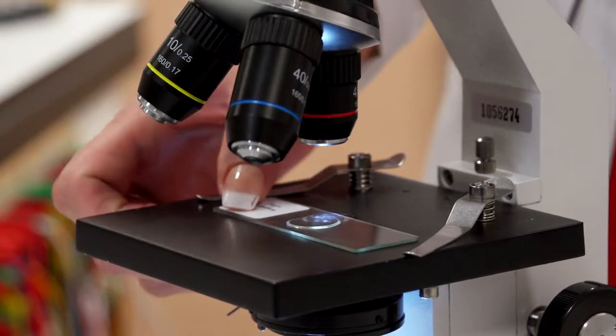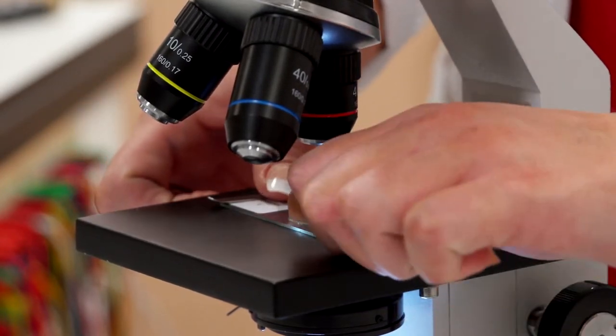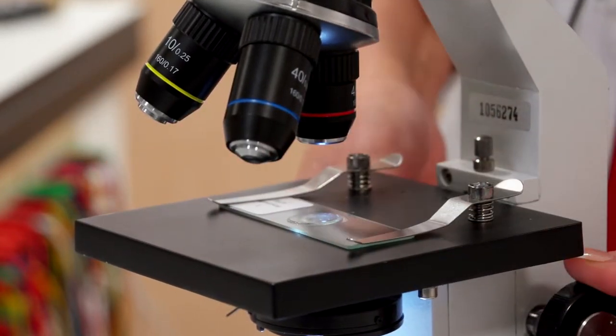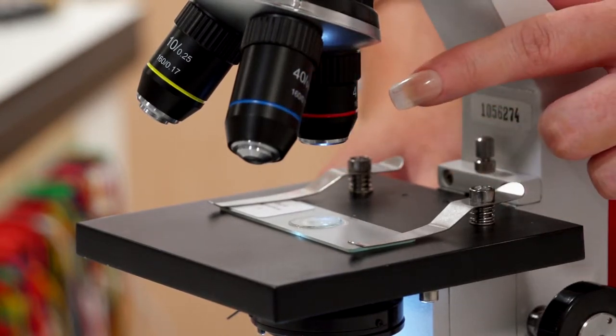So to view a slide, place your slide on the stage and hold it in place with the stage clips. Make sure your stage is at the lowest point using the rough focus wheel. Make sure your lamp is on and that your objective lens is at the lowest setting. Then view through the eyepiece to see your specimen.